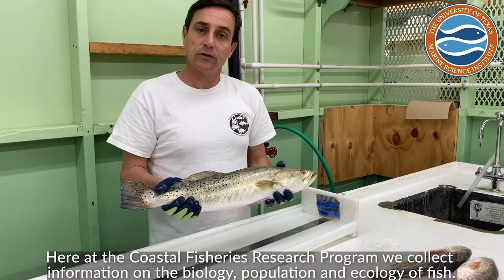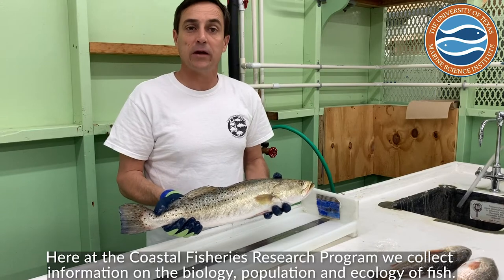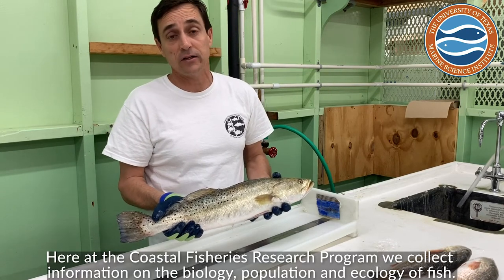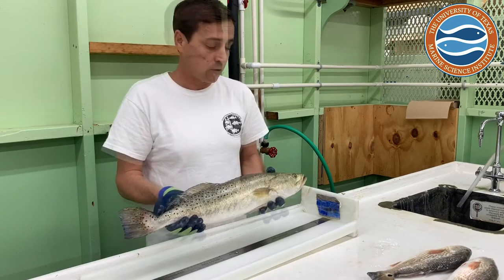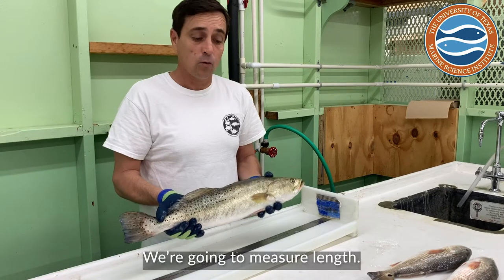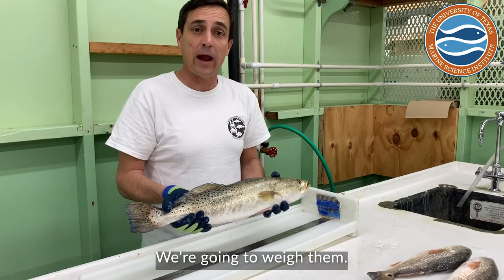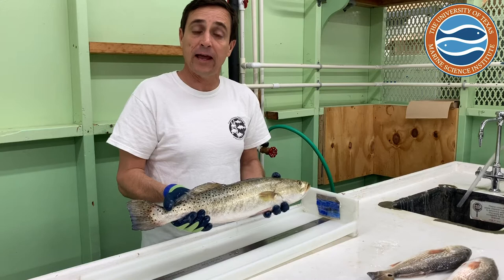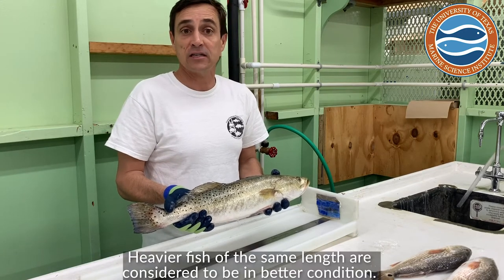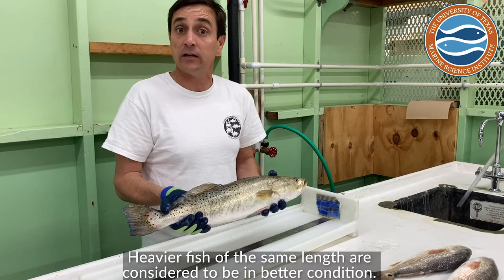Here at the Coastal Fisheries Research Program we collect information on the biology, population, and ecology of each of these different species of fish. Today for each of these fish we're going to measure their length and weigh them. You can look at the weights for different fish at different lengths to see how their condition is — heavier fish at the same length are considered to be in better condition.